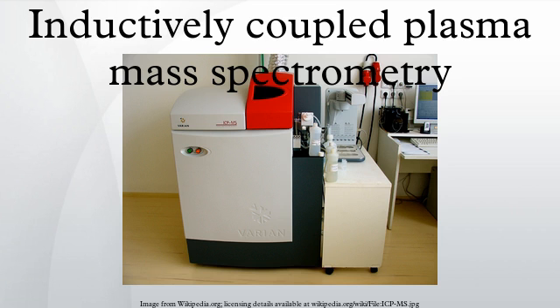As a droplet of nebulized sample enters the central channel of the ICP, it evaporates and any solids that were dissolved in the liquid vaporize and then break down into atoms. At the temperatures prevailing in the plasma, a significant proportion of the atoms of many chemical elements are ionized, each atom losing its most loosely bound electron to form a singly charged ion.